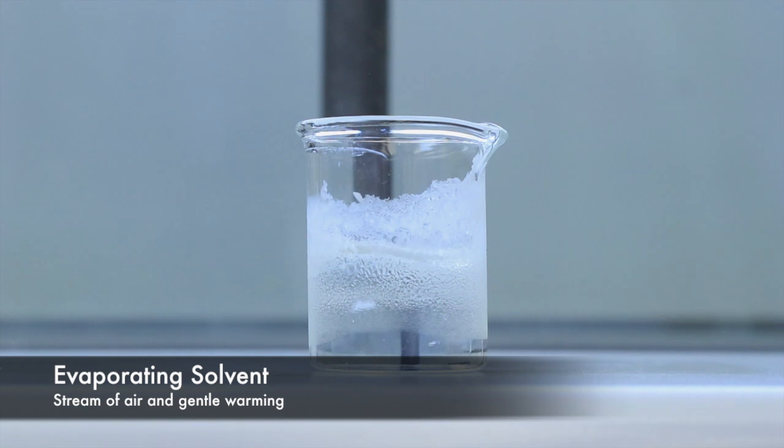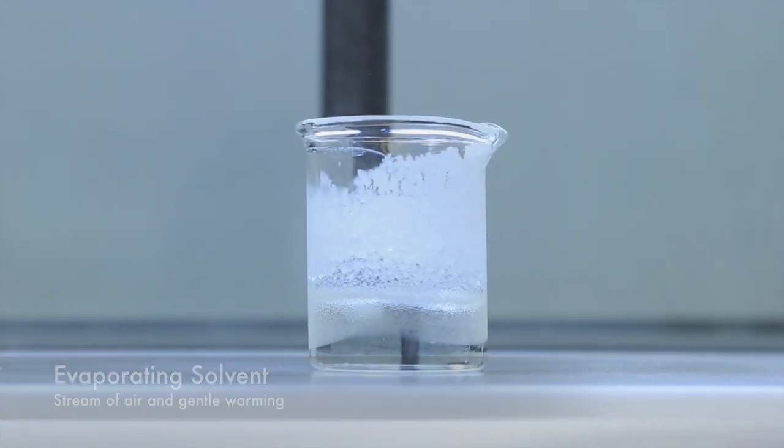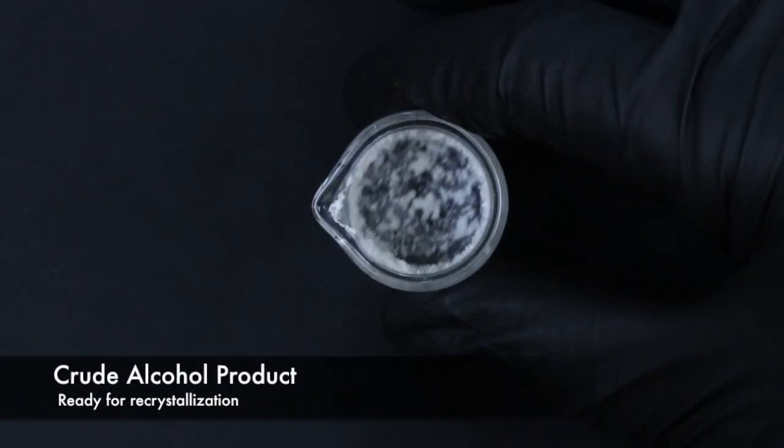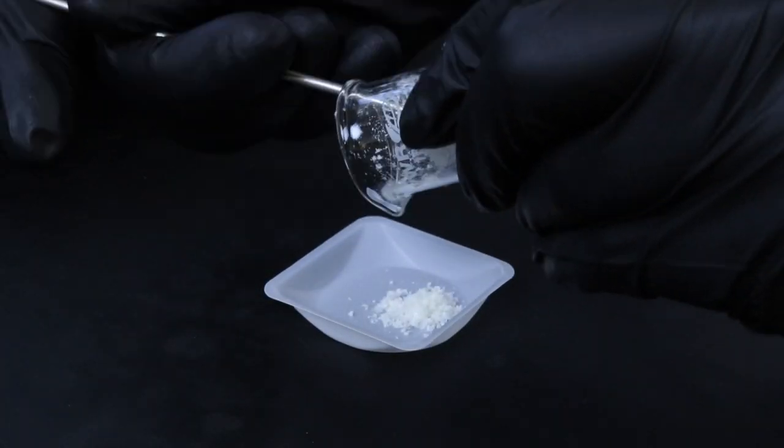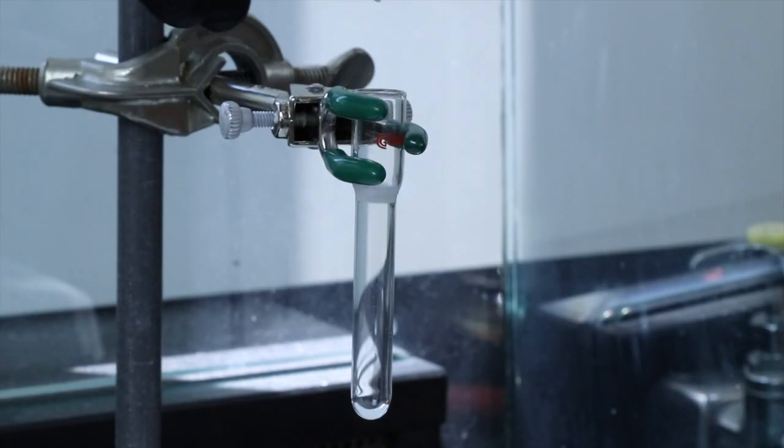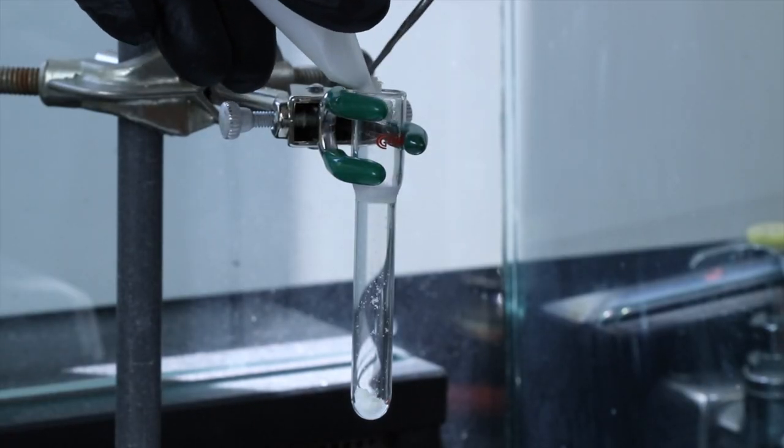Now I can just evaporate off the solvent, and you can actually start to see the alcohol product gathering on the side of the beaker here. But this is what the crude product looks like once I've evaporated off all of the methylene chloride. And now I'll be transferring that crude product to a Craig tube so that I can purify it through recrystallization.